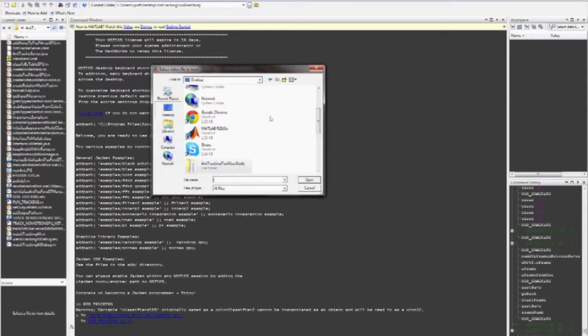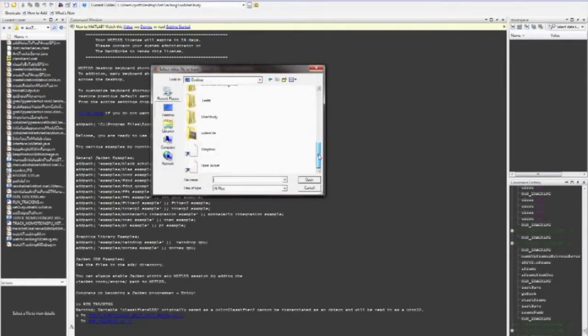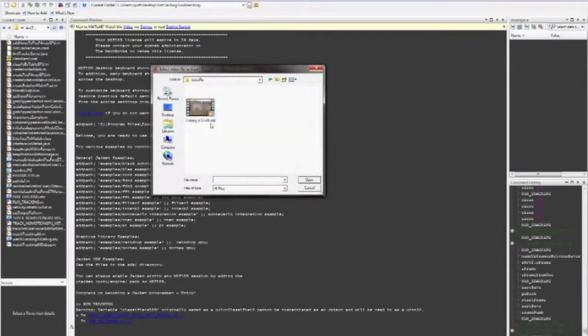A browsing window will appear. In this window, please find the video file containing the insects you would like to track.